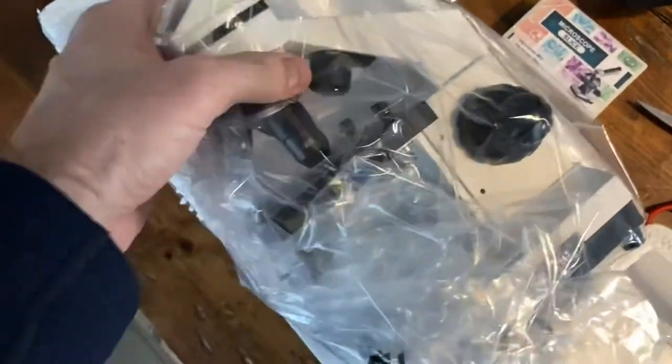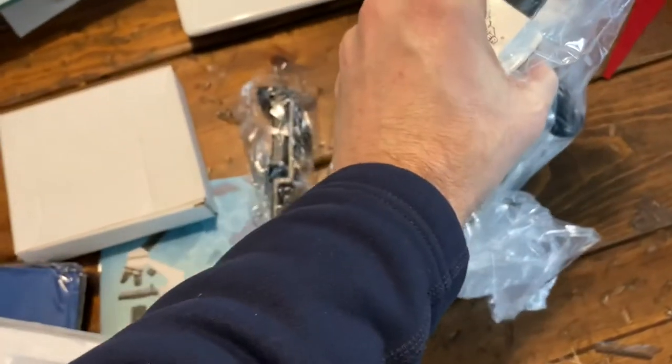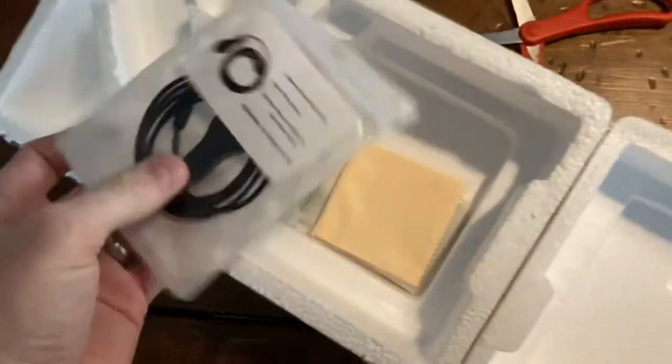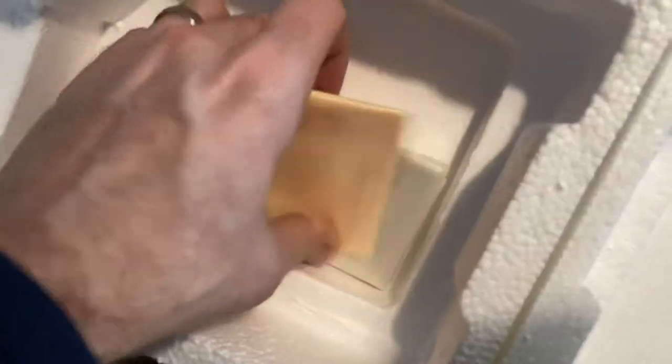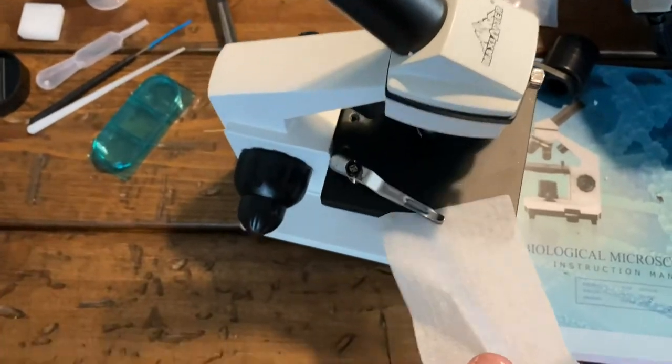Here's this one right out of the box. It arrives really well packaged, and it's pretty heavy duty in terms of weight — it doesn't feel like cheap plastic. It's got a solid metal main body design. It also comes with plenty of accessories, including slides, a cleaning cloth, and lots of other little pieces.